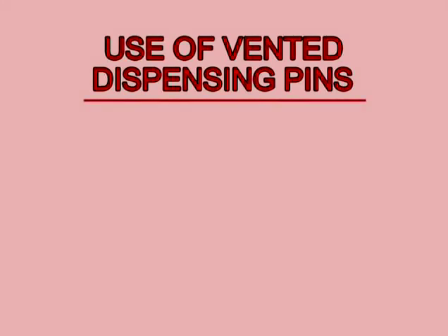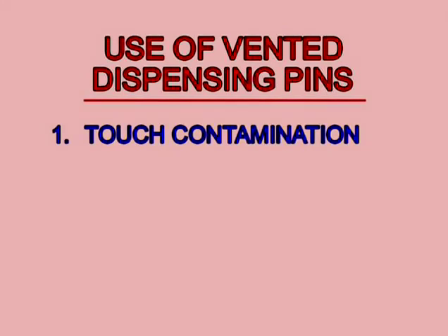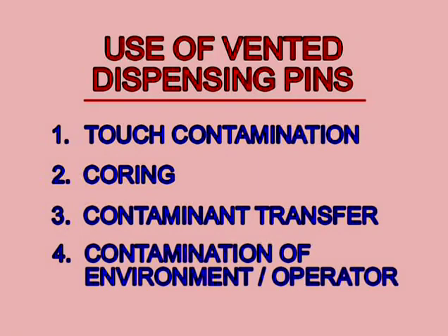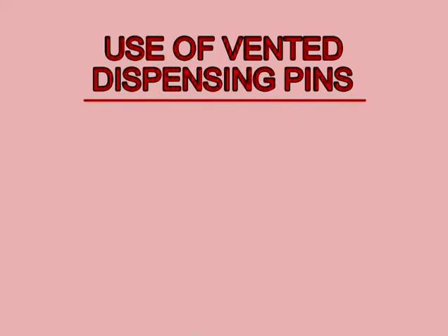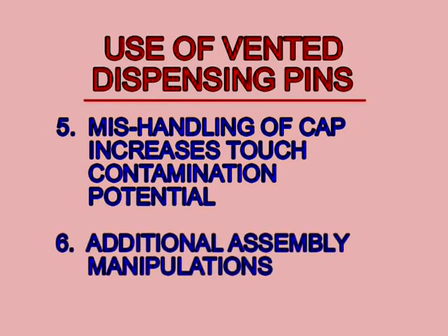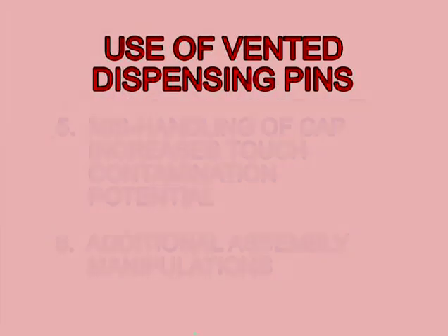Use of vented dispensing pins. Risk factors are touch contamination, particulate contamination due to coring, contaminant transfer, and contamination of the environment and operator. Improper handling of the dispensing pin cap may increase the risk of touch contamination. Also, use of a dispensing pin requires extra assembly manipulations. More manipulations present more opportunities for contamination.